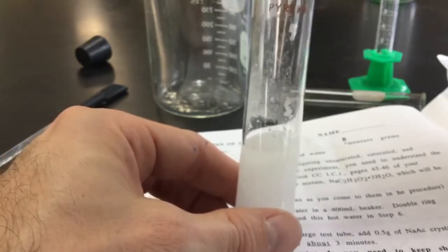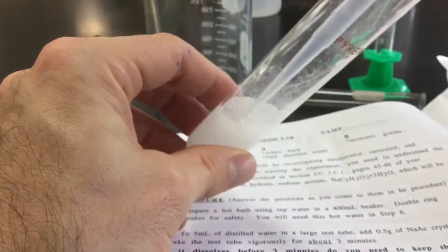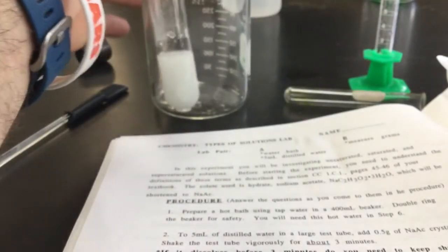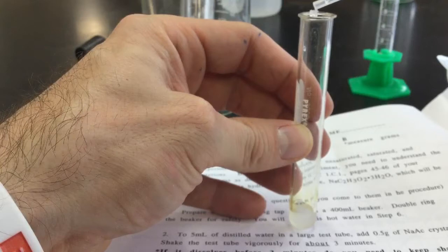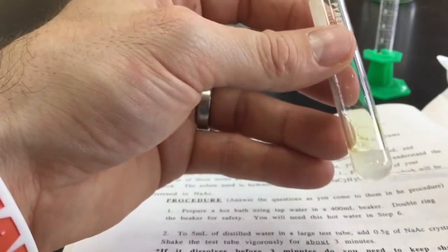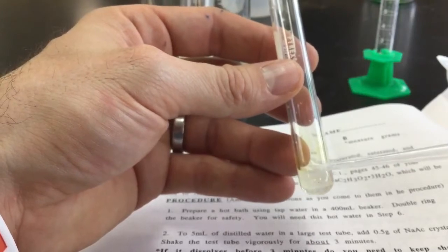Before heating, go inside the test tube with your pipette, get some of the slurry, and put it into a small test tube. Take a crystal and drop it in to see if it dissolves — I'm trying to figure out if this is saturated or unsaturated. I can see that crystal floating around in there; it did not dissolve. So we can say that solution is saturated — it had no more room for that crystal to dissolve.